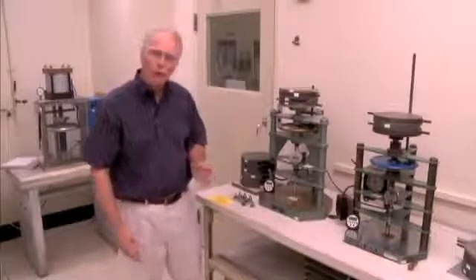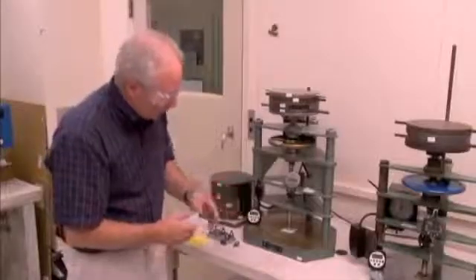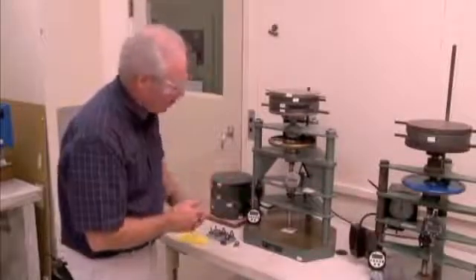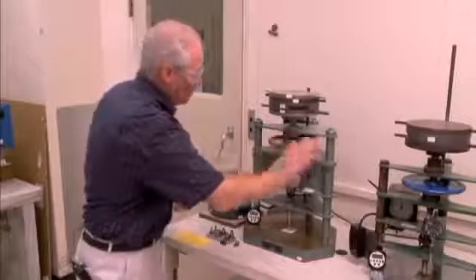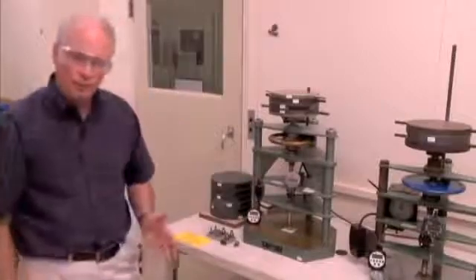Now, the test is really quite simple. The flooring sample is installed in the machine with the appropriate foot. The lab technician will take the initial thickness or the initial reading on the flooring sample. The load is then applied directly to the foot for the appropriate amount of time.